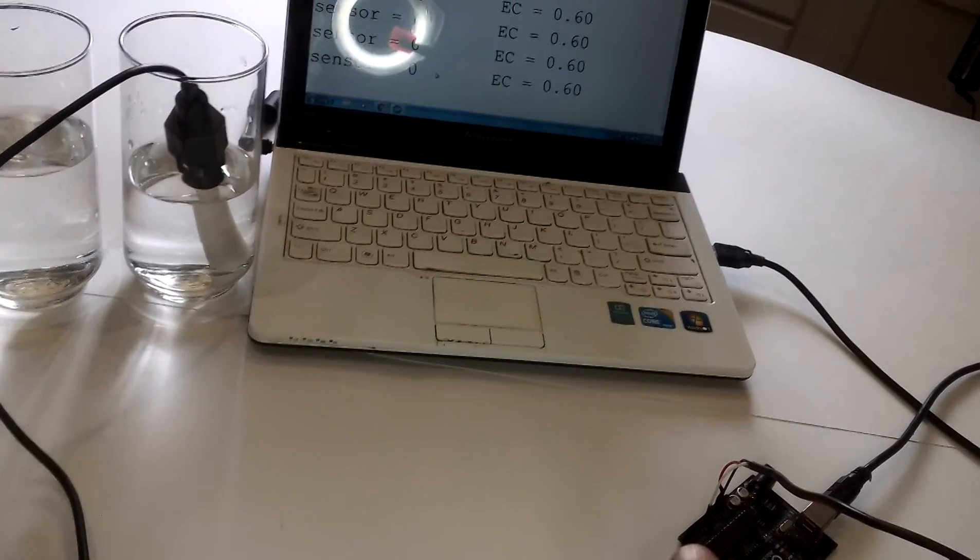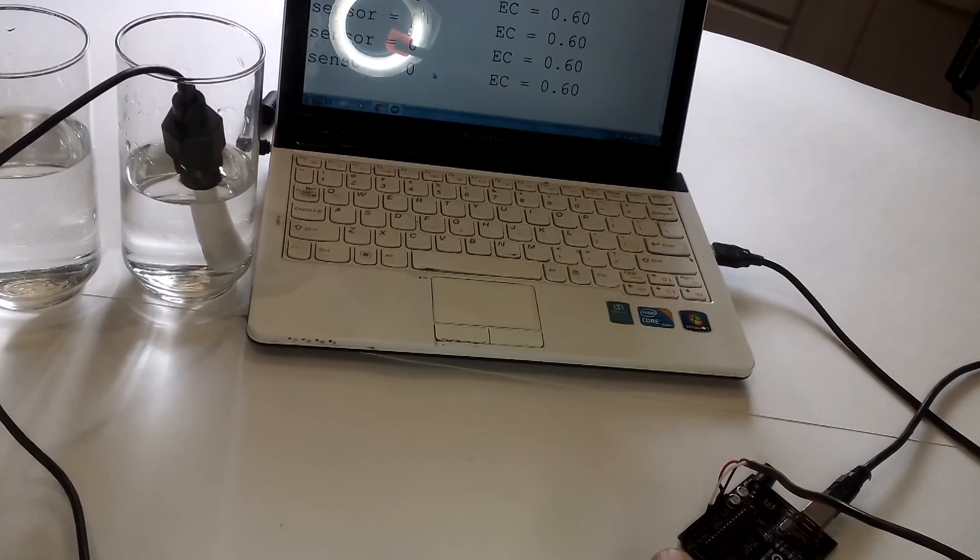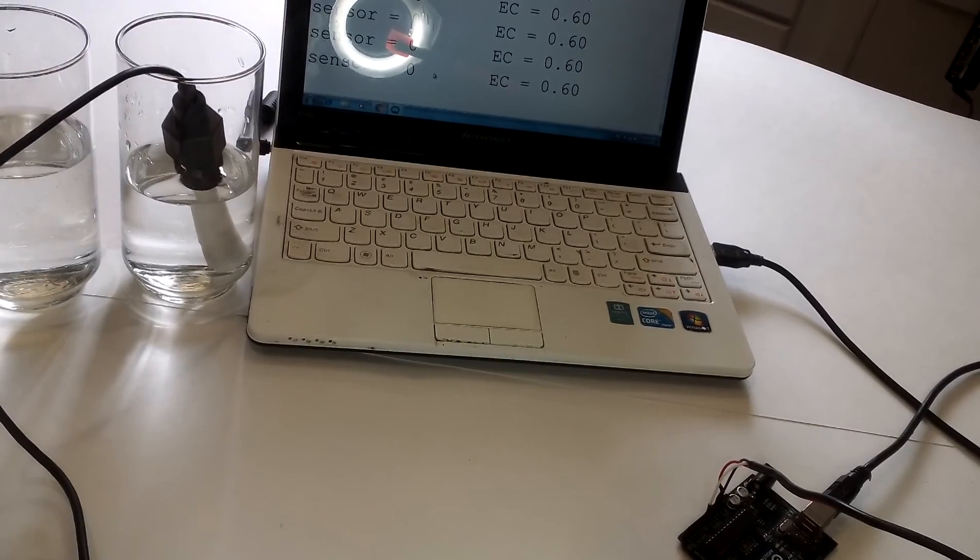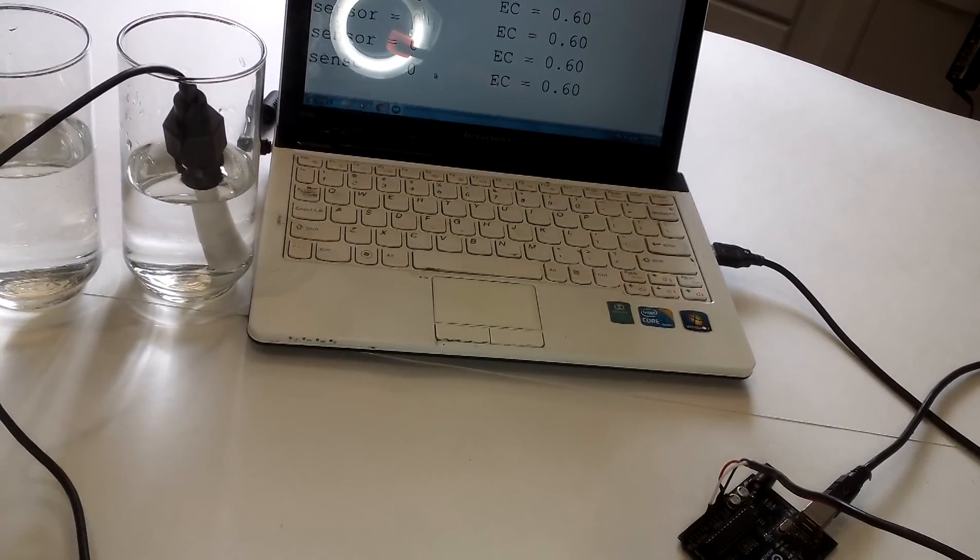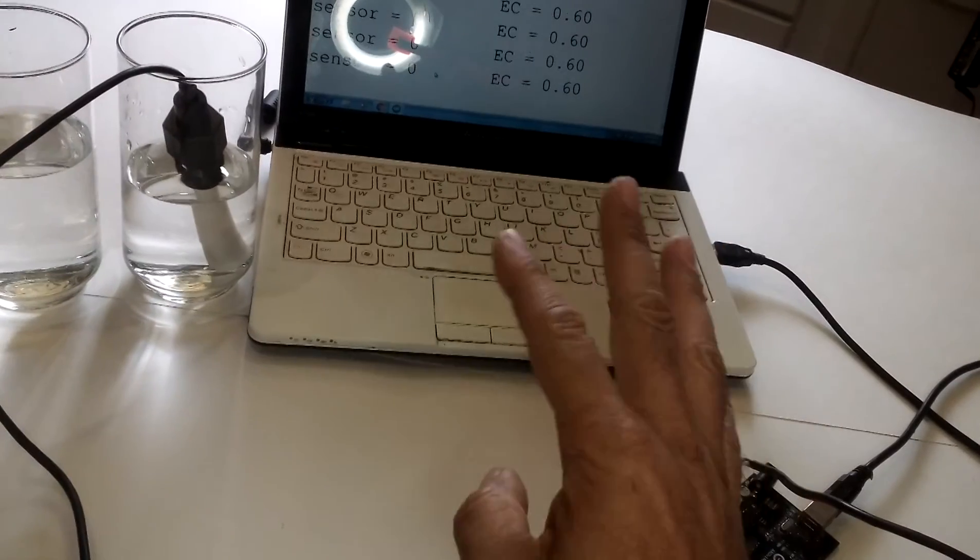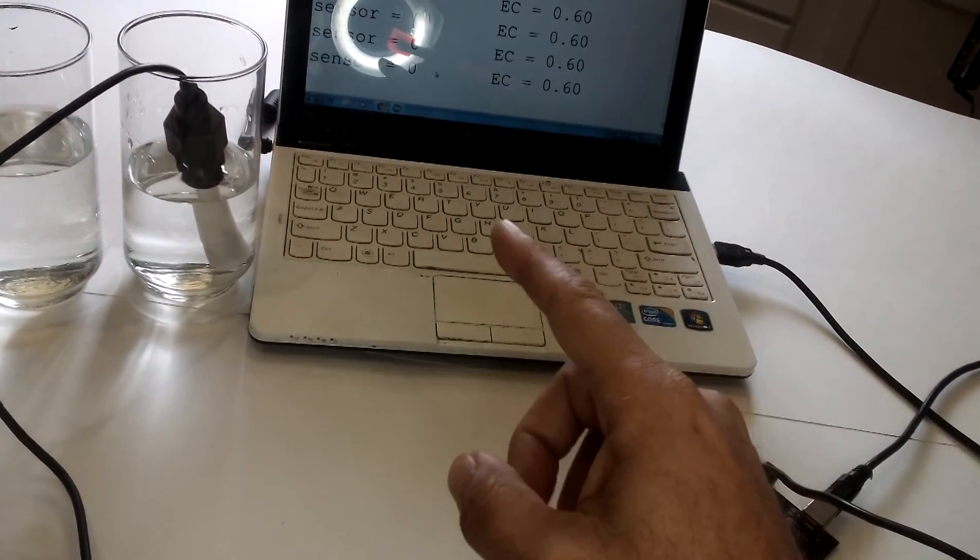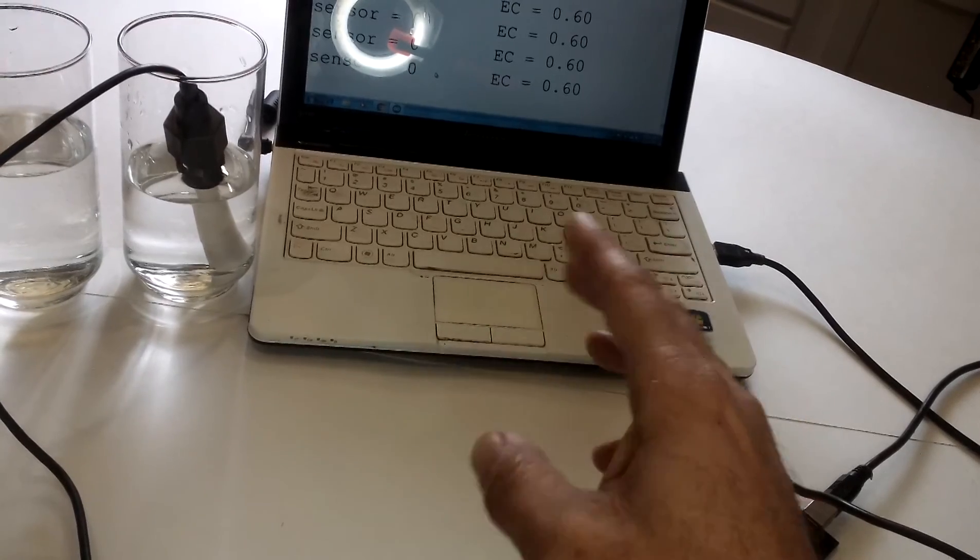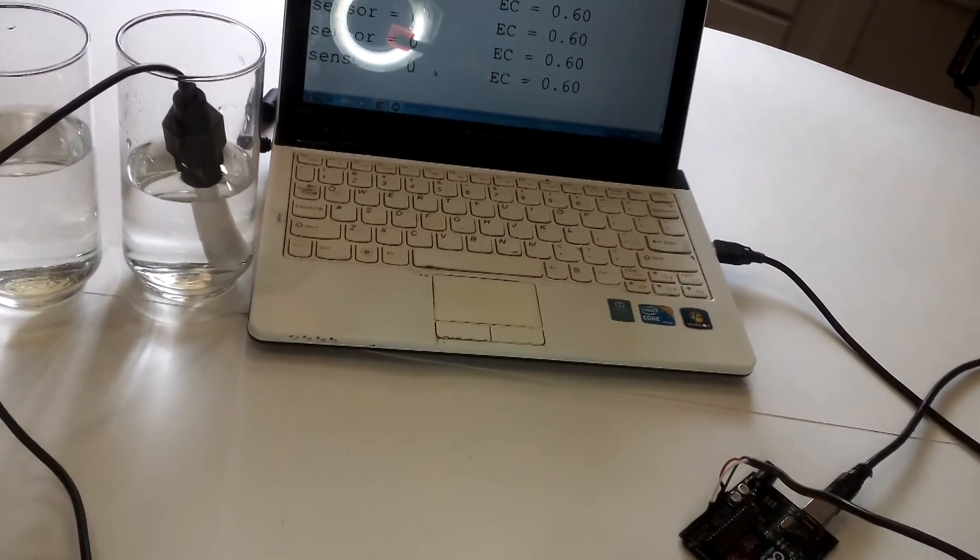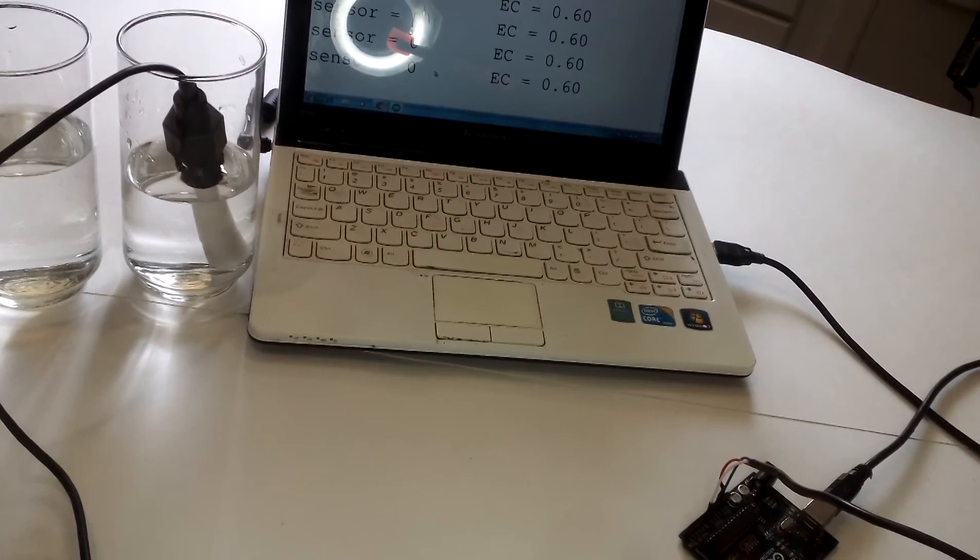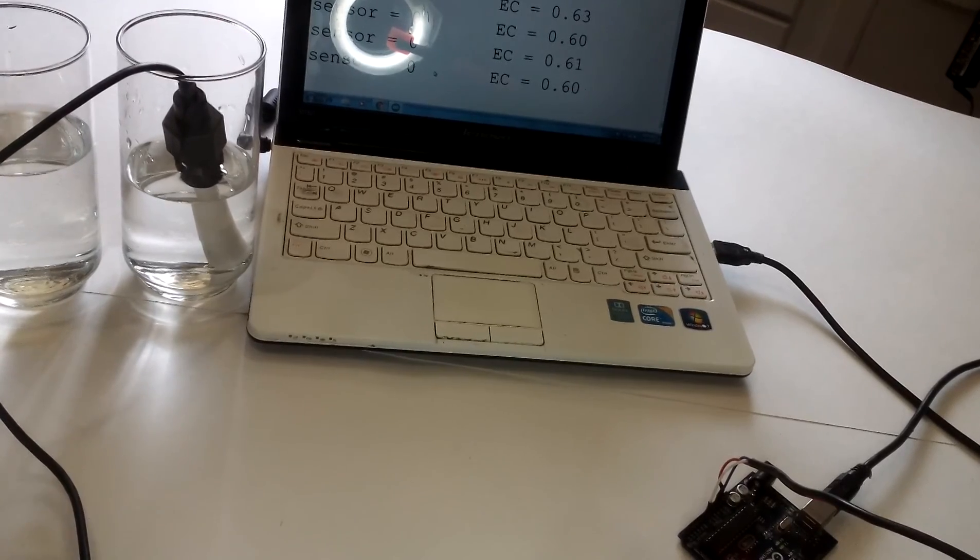Okay. Now you can see the reading instantly changed to 0.6 EC. Now you can change the value so you can actually read the microsiemens or ppm but just by changing the numbers on the sketch. But for now it's EC of 0.60.